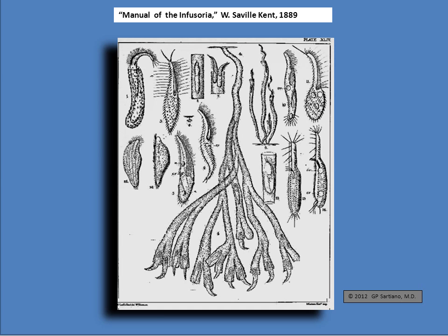On the other hand, it also beautifully illustrates the loricate form of Stichotricha, including one in a single tube, two organisms sharing a single lorica, long tubular individual loricas, and a multiplex lorica housing what is effectively a sessile colony of organisms. Note that the organisms within the long individual sheaths are rather twisted in appearance and may actually have been Chaetospira.